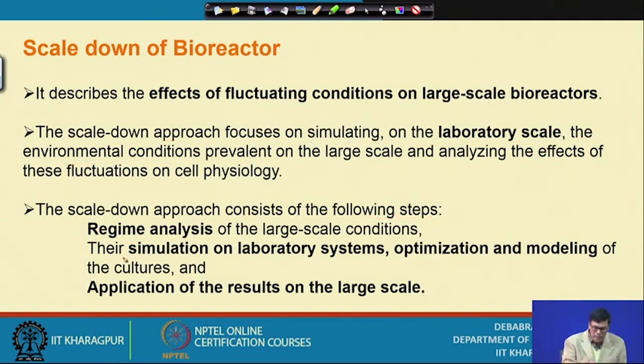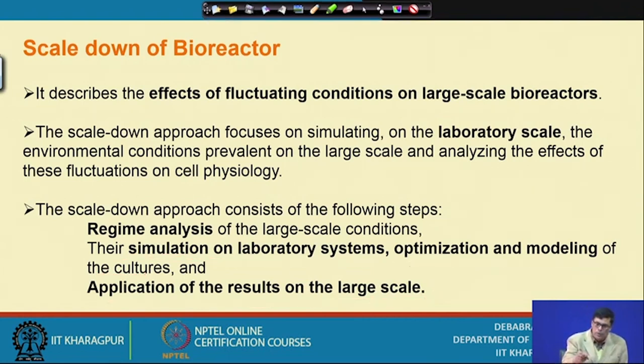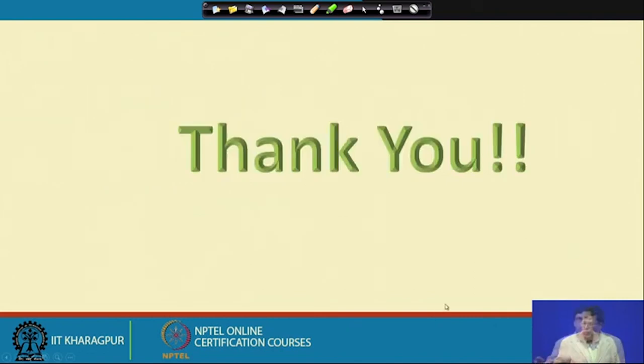Then comes the simulation of the laboratory system, and optimization and modeling of the culture, which I have already mentioned, and application of the results on the large scale. Whatever good results we find in the small scale, we can then test in the larger scale. So, before we go for large scale operation, it is always advisable to keep the run in the smaller scale.